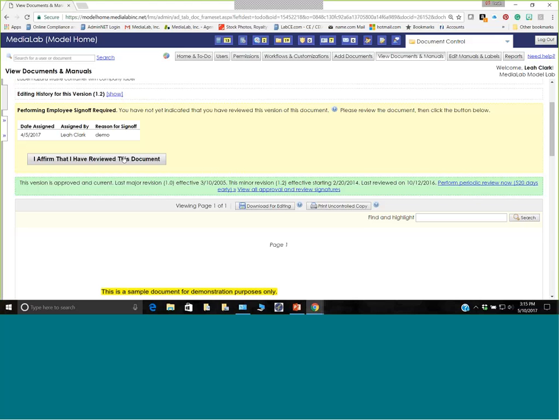So they wouldn't actually see this button until they completed the quiz and passed the quiz with 100%. So it's a great way to ensure that they actually took the time to read those documents and not just clicking the button.